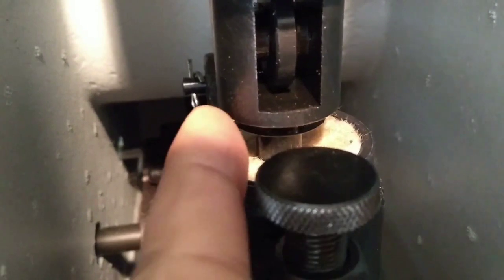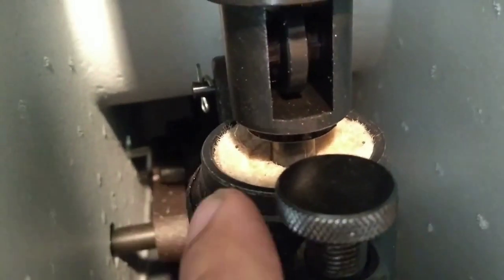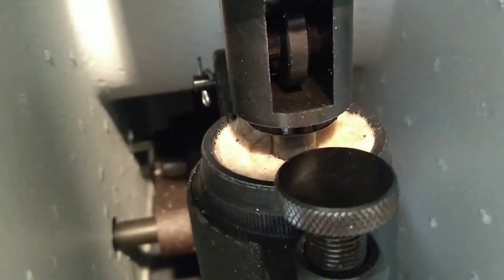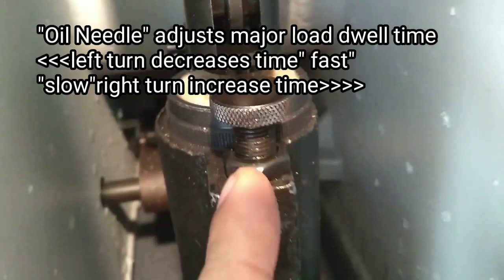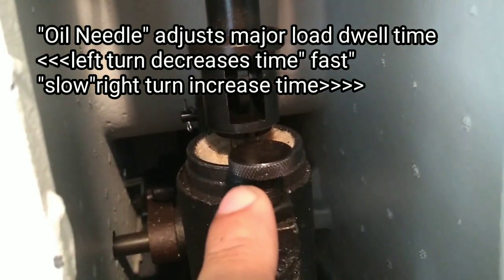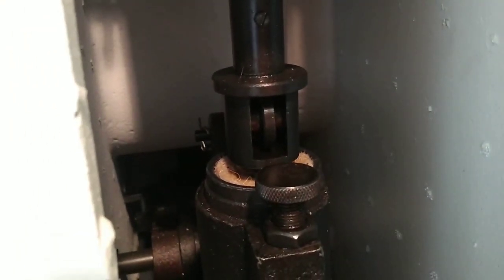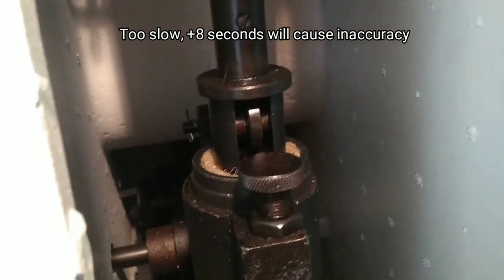What we have here is what's called an oil carpet — this little furry component. We fill this up with a number 32 machine oil, and what they mean by that inside the instruction manual is ISO 32 oil, which is about a 10-weight motor oil. This right here is for adjusting the speed at which the force is applied. We want the force to be about 6 seconds. So if we count here, we'll go ahead and load — 1,000, 2,000, 3,000, 4,000, 5,000, 6,000. So about 6 seconds, and that's where we want that to be.